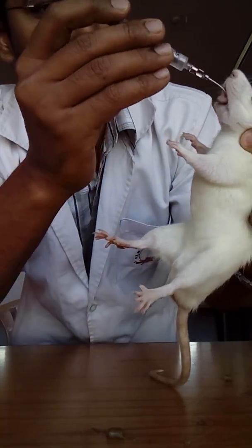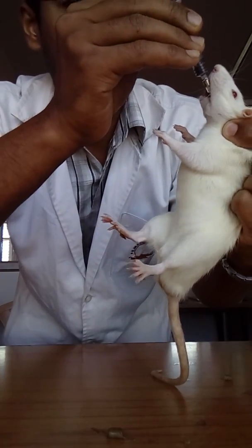We feed from the upper side and inject the drug. This is how we can inject drug to the rats.